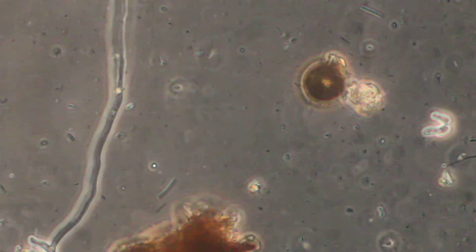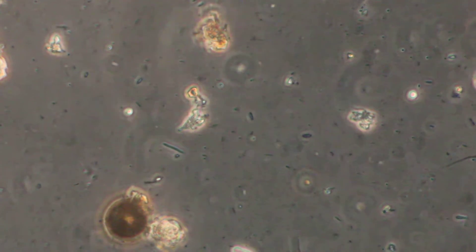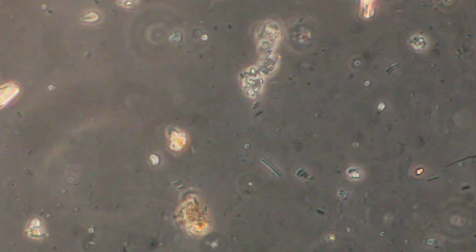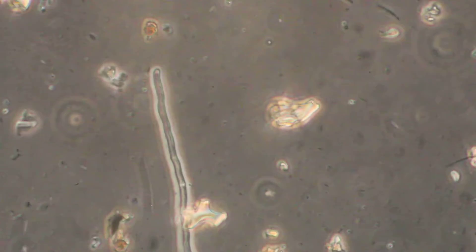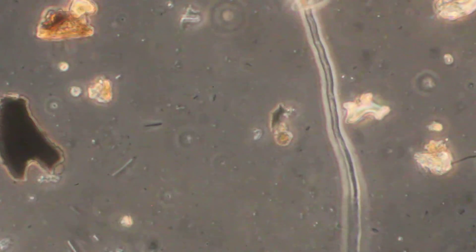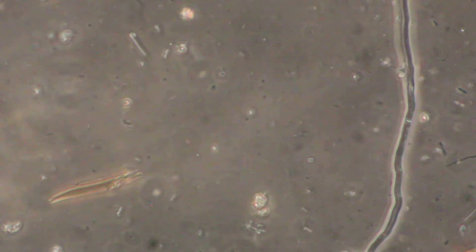That's the thing about these living microorganisms — this is really what we're trying to promote in our soils for increasing nutrient cycling. This is what makes all those amendments that we're adding to the soil available to the plant. And you can see there's a lot of good diversity in the different shapes, sizes, or morphology as it's called.